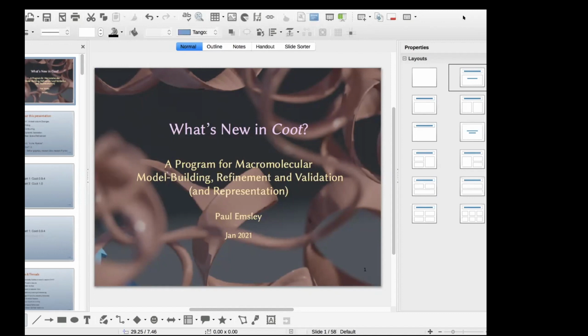With that, Paul, thank you very much. It's great to see all the new features that are coming. I do an introduction to molecular modeling and graphics for the first year grad students here, and I often think: if we had to build structural biology software today, with the computers, toolkits, and libraries we have right now, would we have chosen these little sticks?